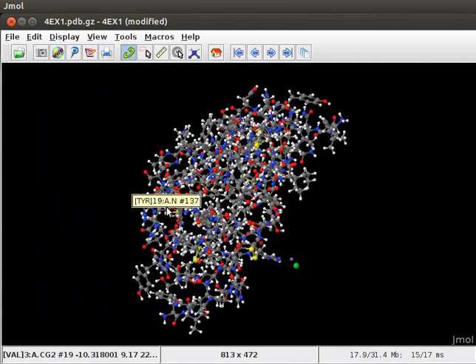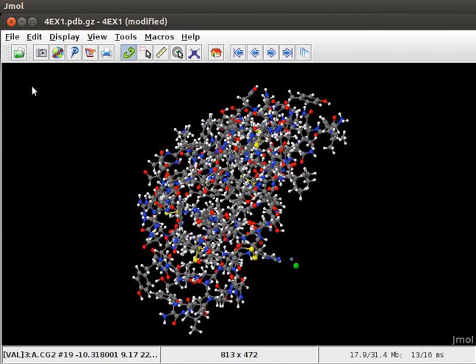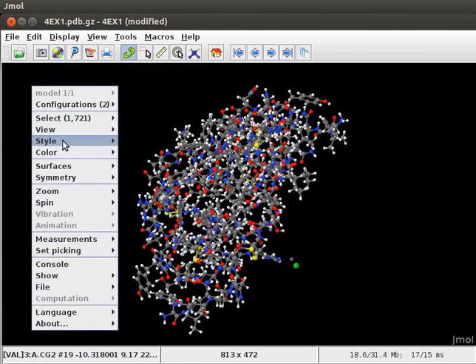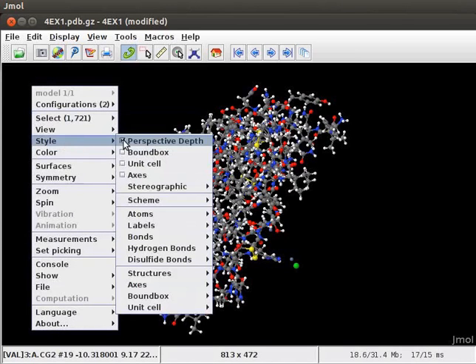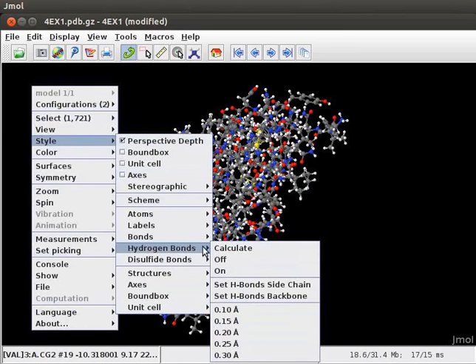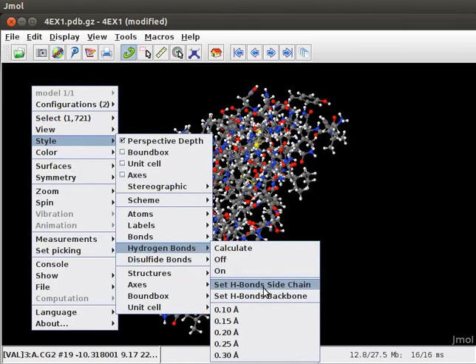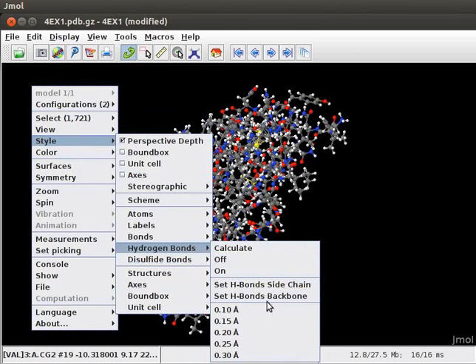We can also highlight Hydrogen bonds and Disulfide bonds in the protein model. To display Hydrogen bonds, open the pop-up menu, scroll down to Style, and then Hydrogen bonds option. The Hydrogen bonds option in the pop-up menu has features such as Calculate, Set Hydrogen bonds inside chain, Set Hydrogen bonds in the backbone, and also has options to change the thickness of the bonds. Click on Calculate option to show the Hydrogen bonds in the model.